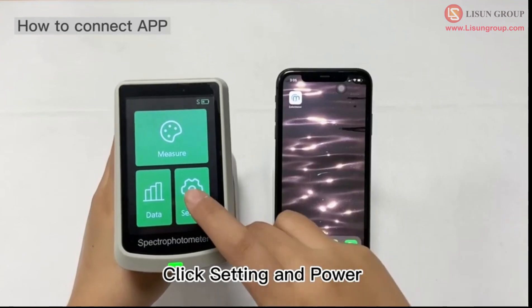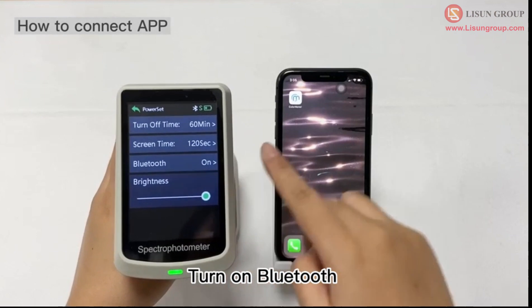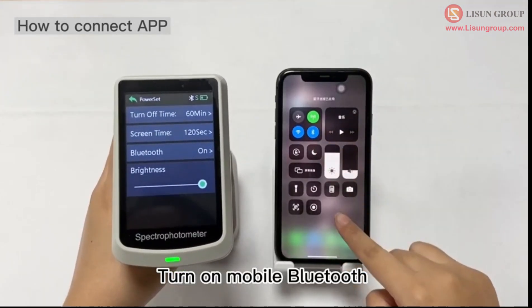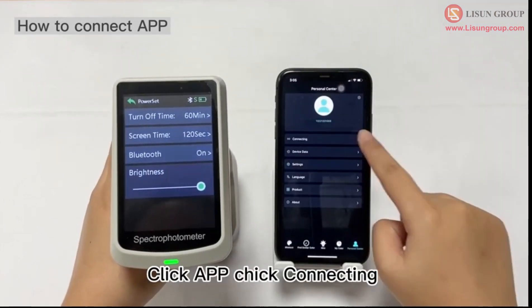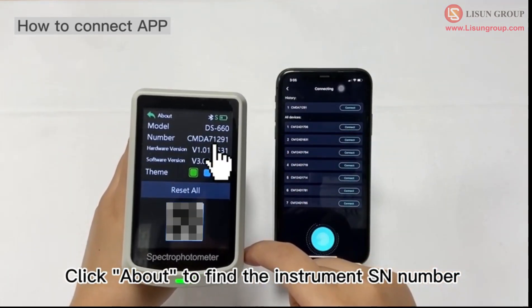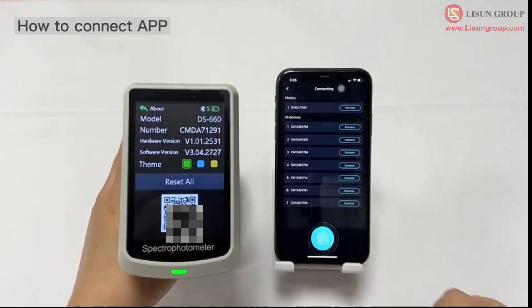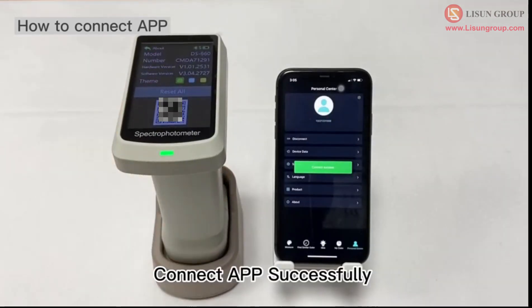How to connect the app. Click setting and power, then turn on Bluetooth. Turn on mobile Bluetooth as well. Click the app and click connecting. Click about to find the instrument serial number, then click connect. App connected successfully.